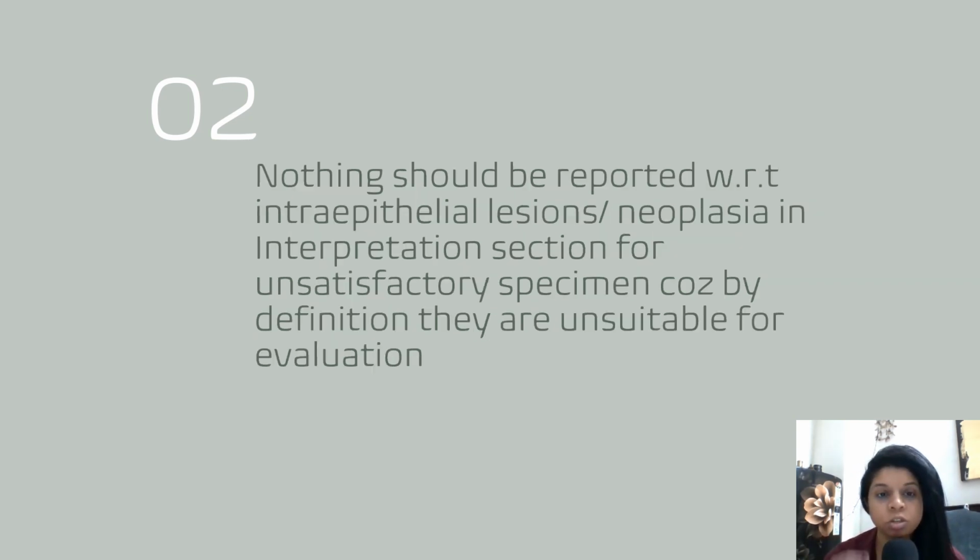This is also important: nothing should be reported with respect to intraepithelial lesions or neoplasia in the interpretation section for an unsatisfactory specimen, because by definition they are unsuitable for evaluation. That means an obscured slide is unsatisfactory for evaluation. It is not at all suitable for evaluation. So in such cases, you are not supposed to comment on intraepithelial lesion or neoplasia. You just say it is unsatisfactory for evaluation, repeat the smear.